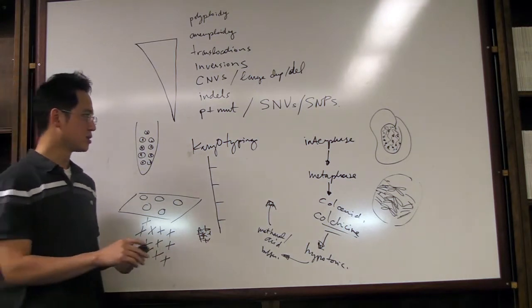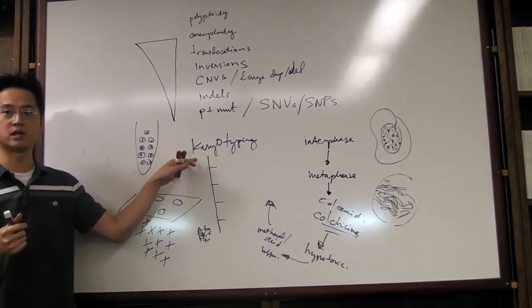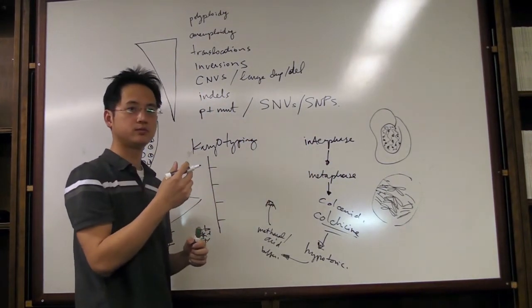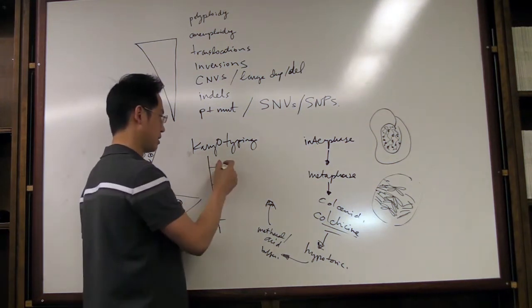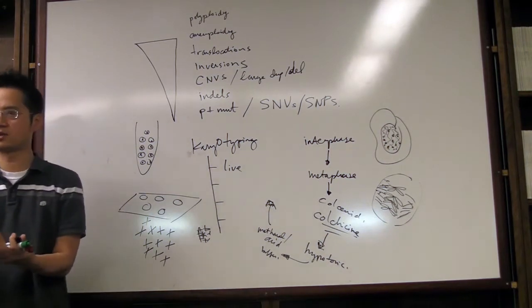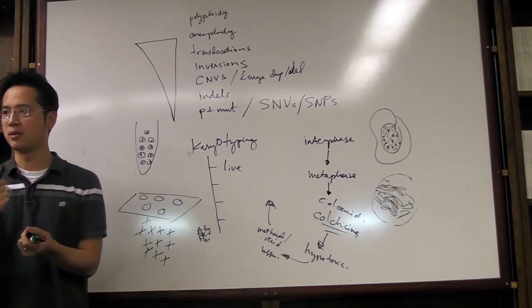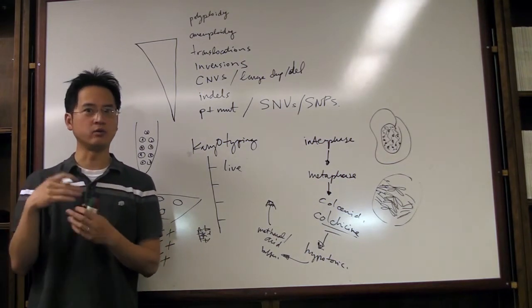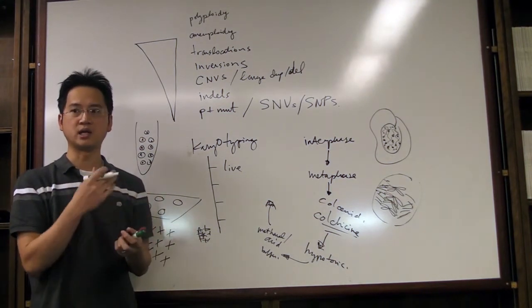spread. So I guess what I started out to list here is you need a certain number of criteria to actually even perform karyotyping, right? So you need to have the cells undergo cell division, which means you need what type of tissue? Not fixed. Fresh. Non-fixed. So it has to be live tissue, right? So from the body, it would be a tumor specimen. Let's say, for example, a tumor specimen that you just acquired from the OR. You quickly have to put in RPMI medium or some happy buffer so that they can stay alive. You quickly send it to the lab, and literally within hours, no more than half a day or something, you have to start processing the sample and getting them to go into culture.